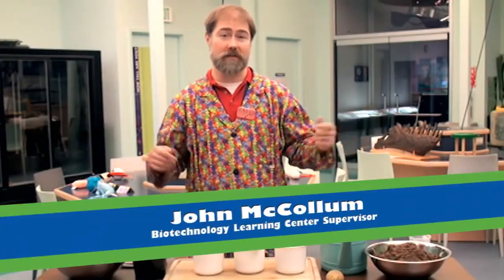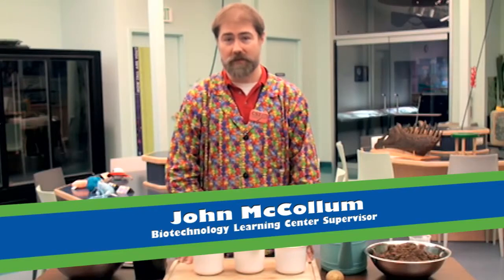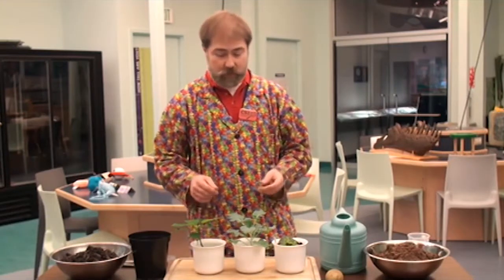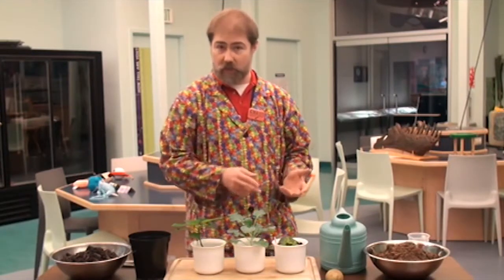Hello, my name is John and I work here in the Biotechnology Learning Center at the Children's Museum of Indianapolis. In this lab space, we do a number of things where we learn about how to make things that help us. Here I have some examples of some plants that we've grown without using seeds. Instead, what we did is we took an original plant and cut a small piece from it. We used that piece to grow a brand new plant that grows into an exact copy, at least genetically, meaning it has the same DNA as the original.